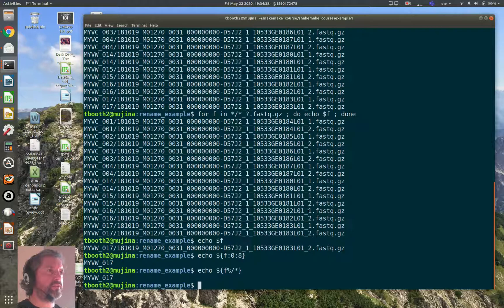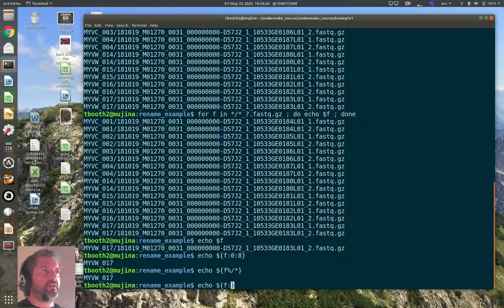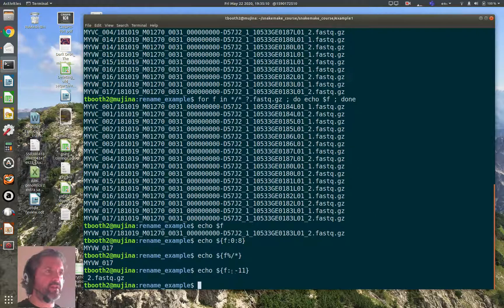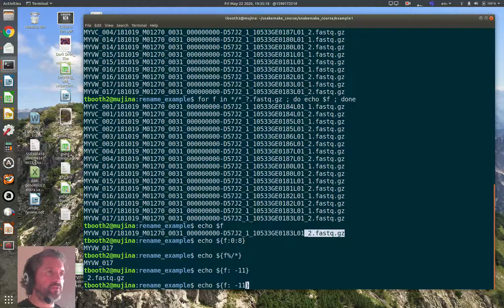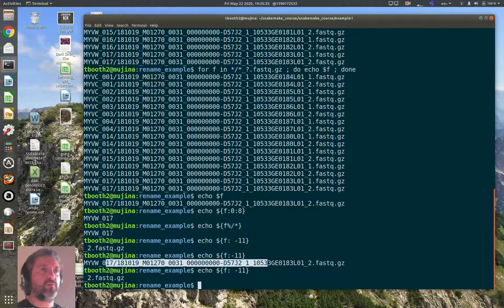The end portion of the filename is a fixed length — it's always `_1` or `_2.fastq.gz`, which is eleven characters. To get the last eleven characters I can count backwards using `${f: -11}` — note the space between the colon and the minus, which is required, otherwise the shell interprets it differently and you won't get the right result. This gives me the `_2.fastq.gz` extension. So I can now extract both the sample name from the start and the extension from the end of the string.